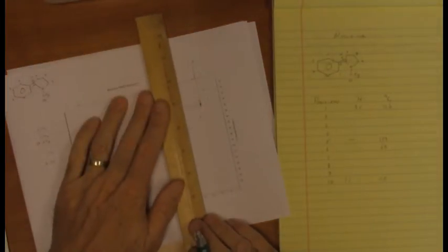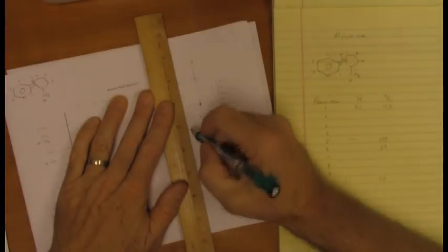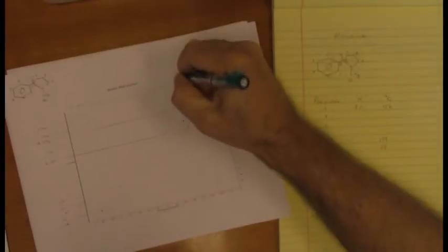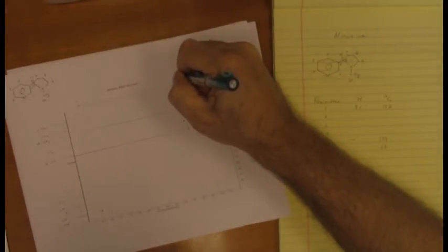We come to the cross peak, and we stop and we turn, and we go to the other axis at a perfect 90-degree angle. There. That must be, I would bet the life of any student in the class, the proton of position 6. It is the proton right there at, I'm going to call it 3.0 ppm.